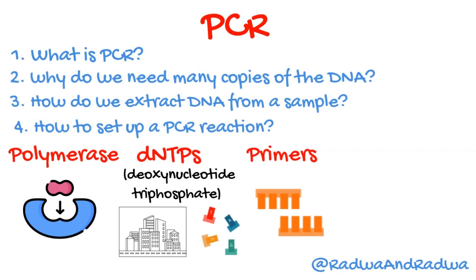And then finally, the fourth component is a collection of reagents that are necessary to maintain a proper medium for our enzyme and our reaction to proceed. So this consists of a buffer that has specific ions like magnesium or manganese in order to help with the stability of the synthesized DNA molecules and allow for the enzyme to properly function.